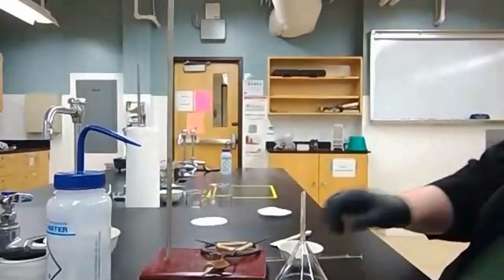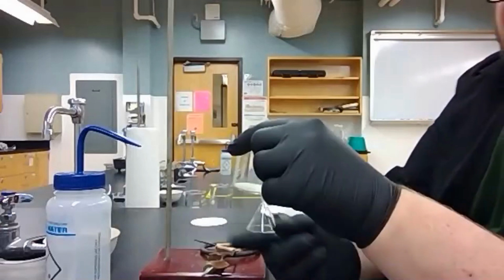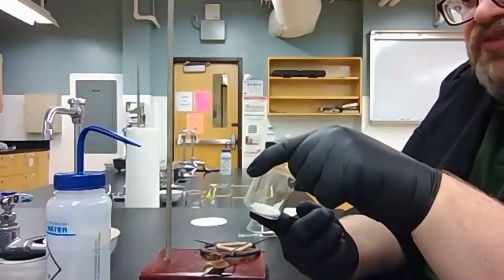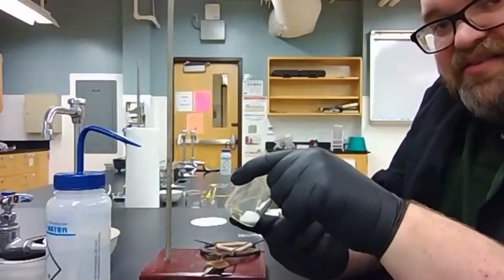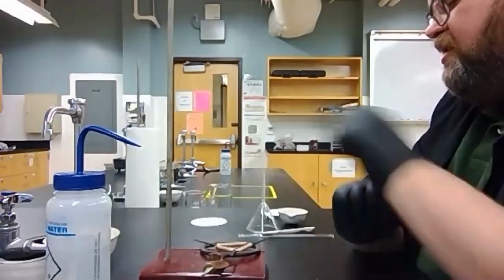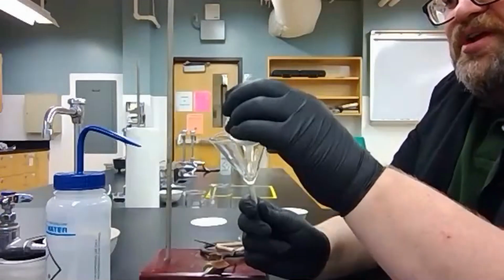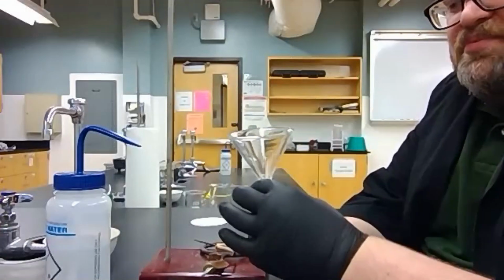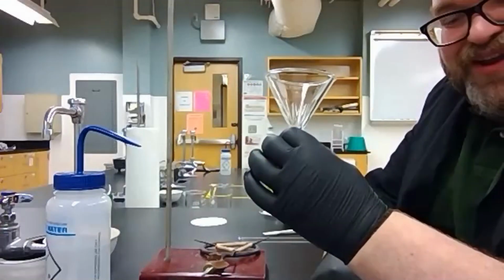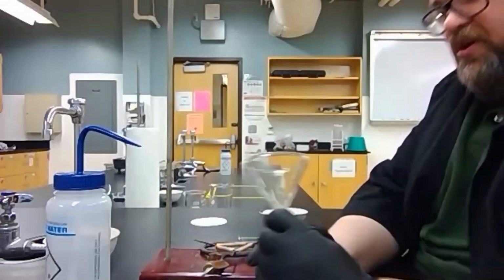So let's turn around here. Okay. I need a method. Once I've got my salt and sand dissolved in water, I need to filter off that liquid and hold back the solid. So what I'm going to use is a funnel. I can pour liquids and solids into a funnel, and it will hold them. Except I'm holding on to it, so that's not good. And I need something for the liquid to go in, so I need to do a little bit of work here.